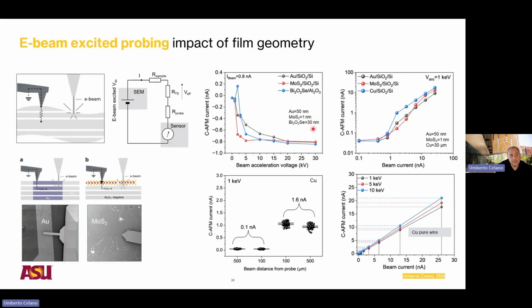So in all of these cases, the relevant amount of charge that will enter the 2D film on the top of the surface is already there and is contributing to your contrast. So in reality, it doesn't really help you very much to work at 30 keV versus 10 if you do not have an objective with respect to that.